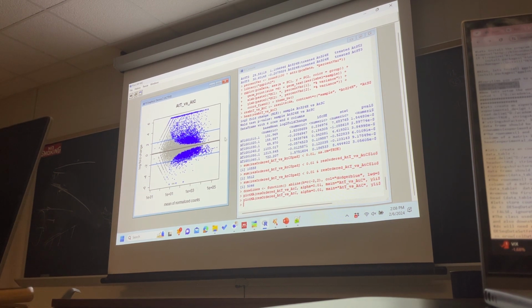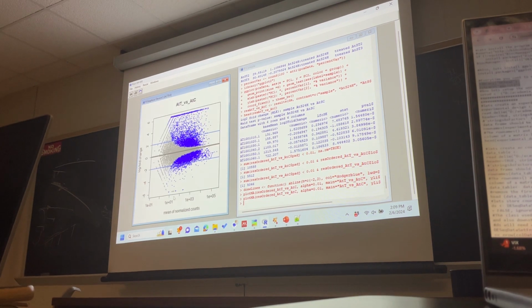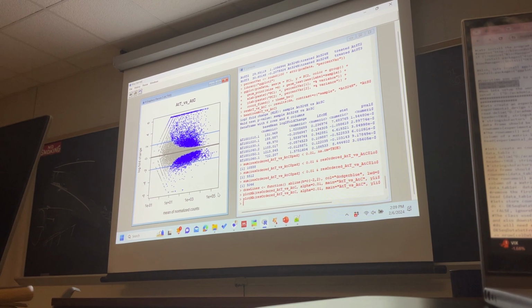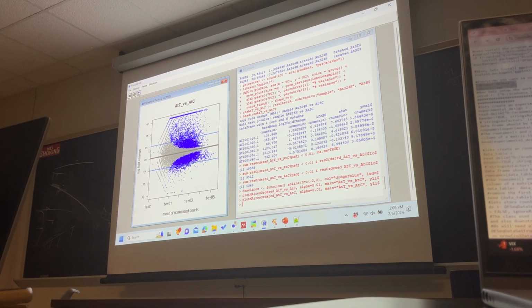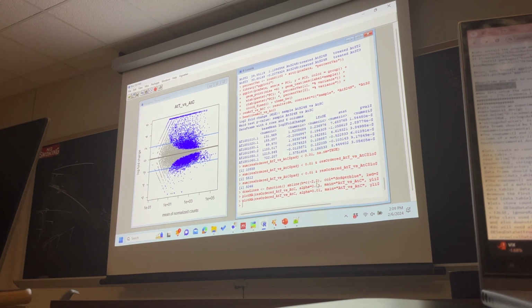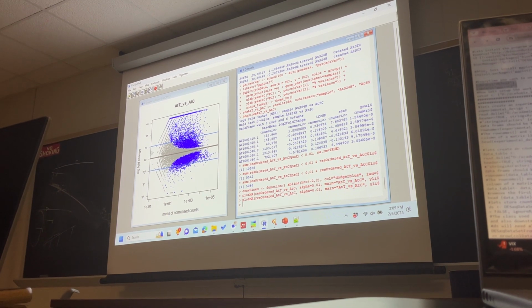Now when you see this one, in the x-axis these are the normalized expression values. These are not the raw count values here. These are normalized based on the DESeq2 protocol. And then the y-axis: because we asked in this draw line command to draw a dark blue line with this thickness at -2 and +2 here, that's why it drew the line here.